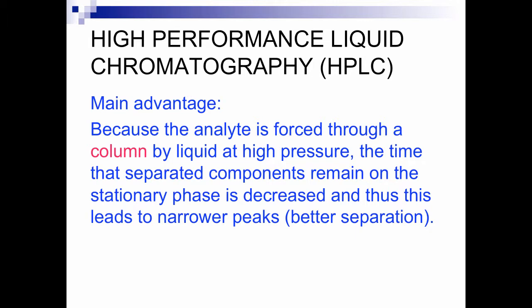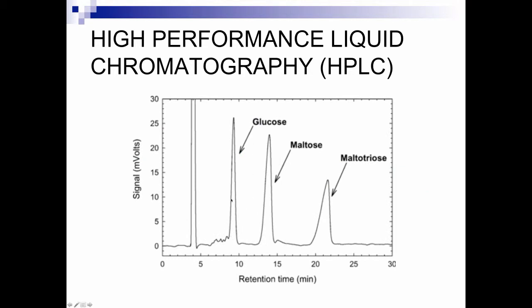the mobile phase at such high pressures that the time that separated components remain on the stationary phase is decreased, and this will result in narrower peaks. And narrower peaks will result in a better separation.